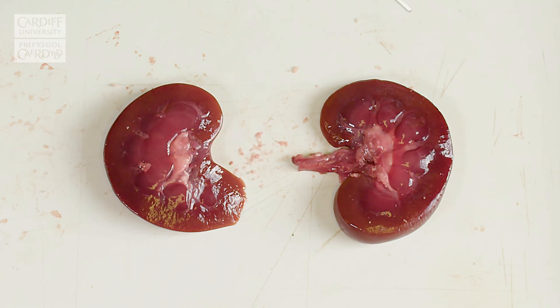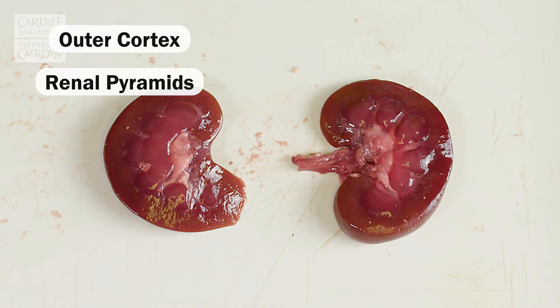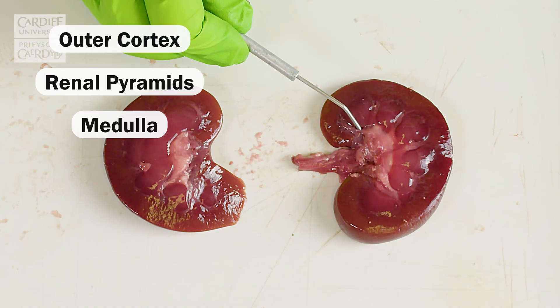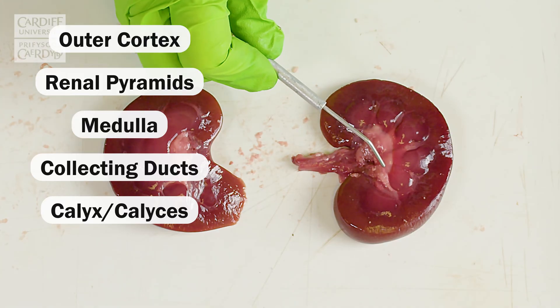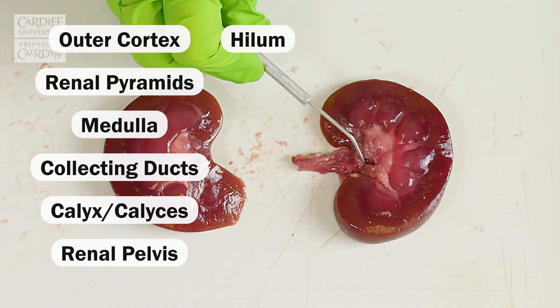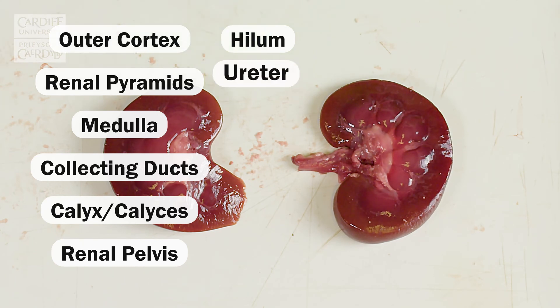So just to recap the anatomy: we have the outer cortex, we have the renal pyramids which collectively make up the medulla. The renal pyramids lead through the collecting ducts into calyces, and the calyces then lead to the renal pelvis, which leads to the hilum. Then the urine exits the hilum via the ureter.